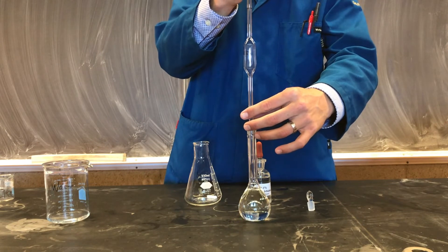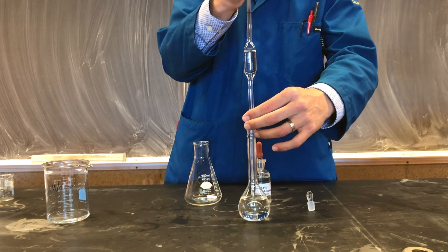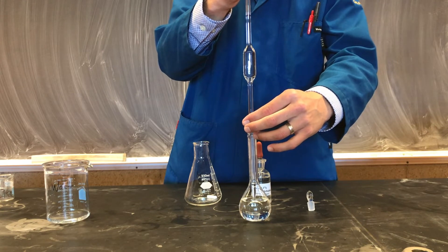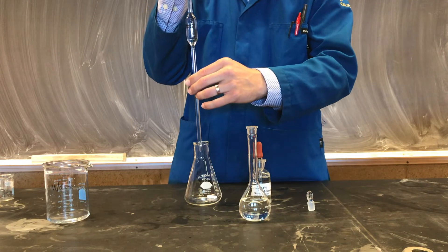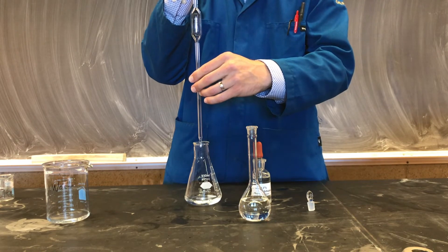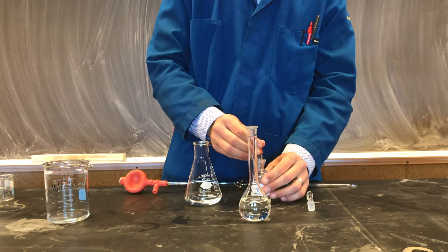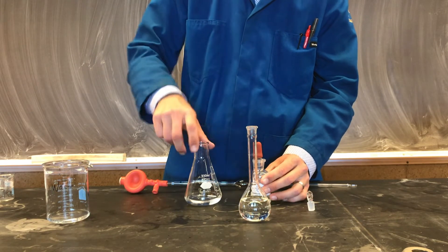We're now ready to draw up a 25.00 mL aliquot of our diluted hydrochloric acid solution. We can then transfer our solution to a 250 mL Erlenmeyer flask, which we'll call the reaction flask. In any titration, it's critical to always remember your indicator. In this experiment, our indicator will be phenolphthalein. We'll make sure to add a few drops to our reaction flask.